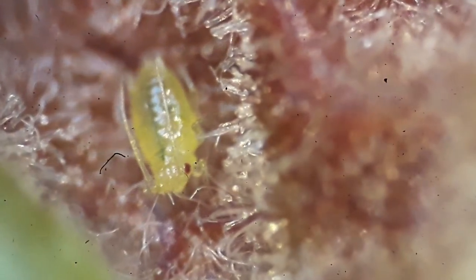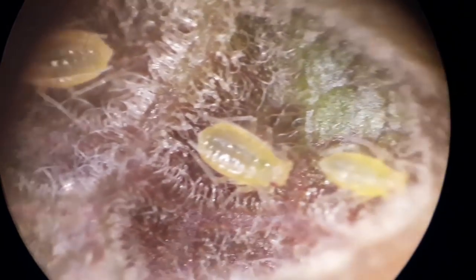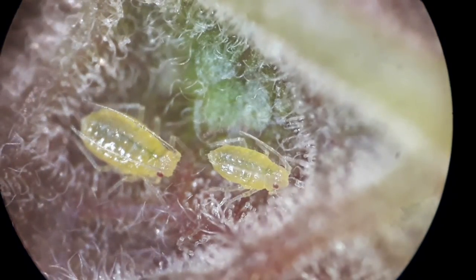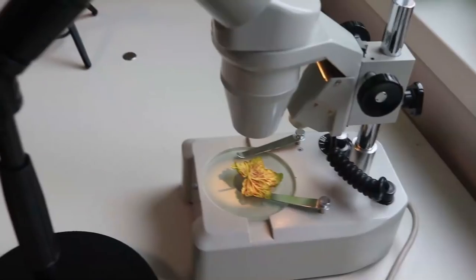In any case these are aphids — just sitting there eating away, and there are two more here. They're a little bit transparent, so if you look carefully you can actually see the organs moving, though they're moving quite slowly. They have different sizes and they all look kind of nice, cute, and innocent somehow — but actually they are plant pests and they can really damage the crops.